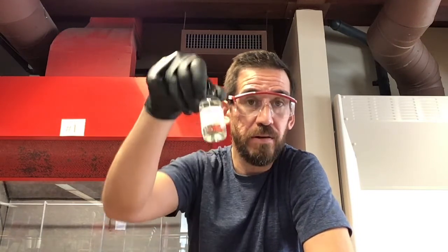But we may or may not be placing these test tubes in the water, and so I just want to make sure it doesn't wipe off. Okay. So what I did here was I placed 2 mL of 15% sodium iodide in acetone, and so our nucleophile is in here, as well as our polar aprotic solvent. And what we're going to do is just add 4 drops of, let's say, our substrates.